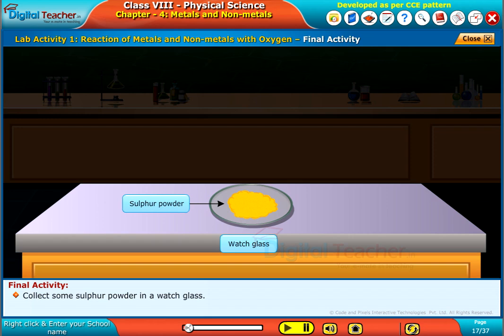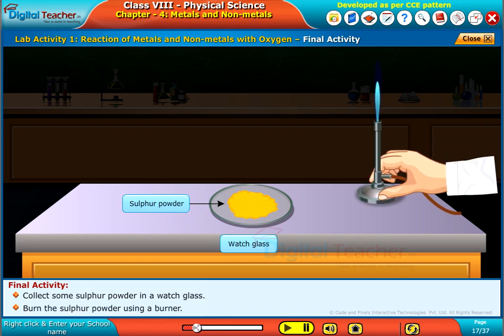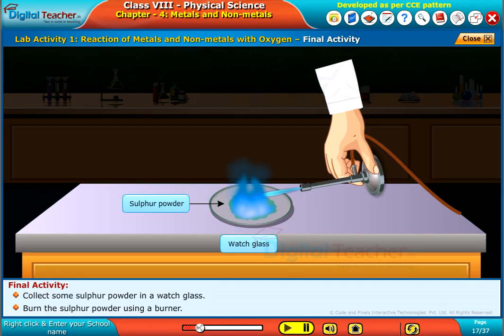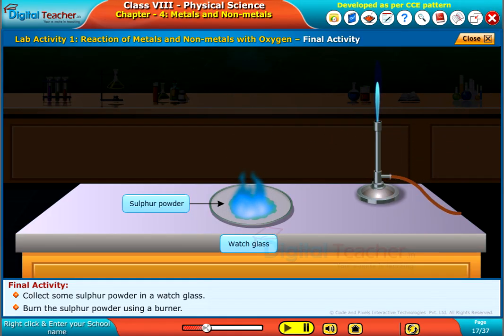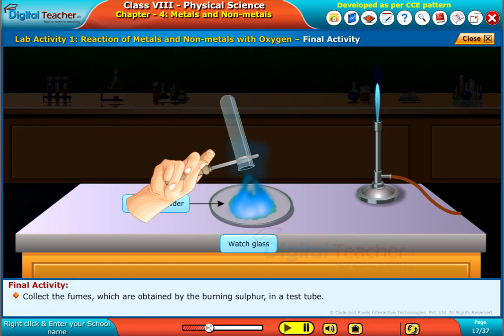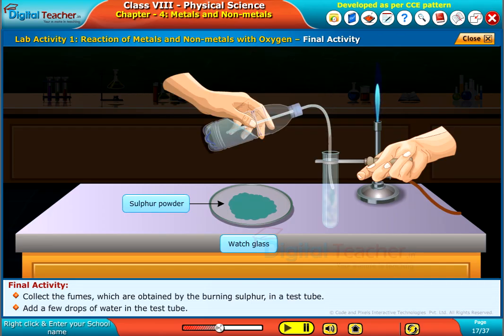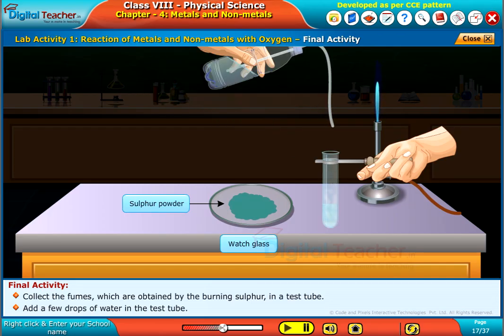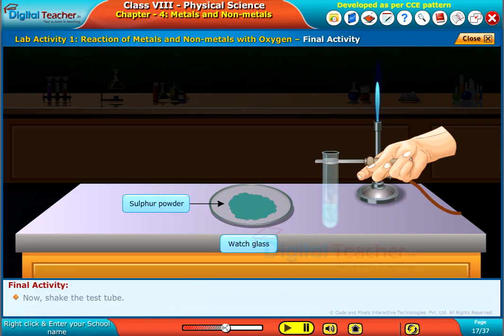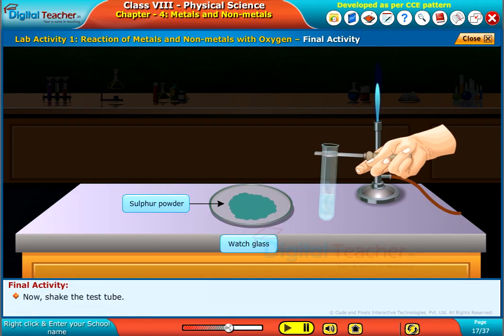Collect some sulphur powder in a watch glass and burn the sulphur powder using a burner. Collect the fumes obtained by the burning sulphur in a test tube. Add a few drops of water in the test tube and shake the test tube.